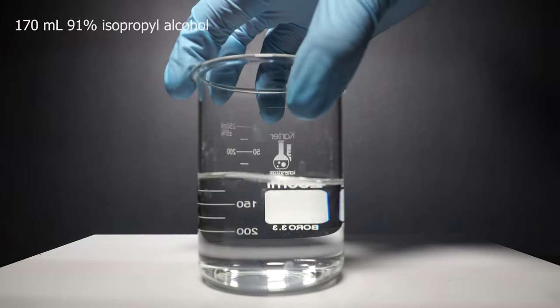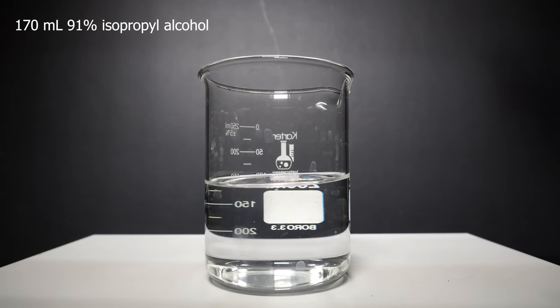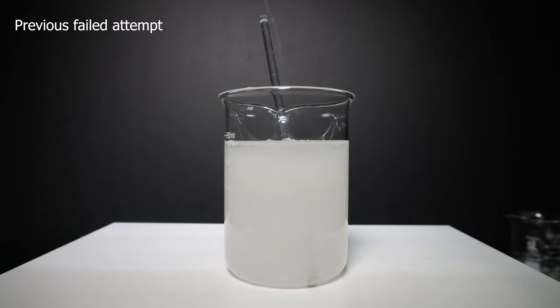Next we'll pour about 170 milliliters of isopropyl alcohol into a beaker. I'm using 91% isopropyl alcohol which means there is 9% water. This ratio is really important because if you use too much water the jelly will not form as well as you would like.